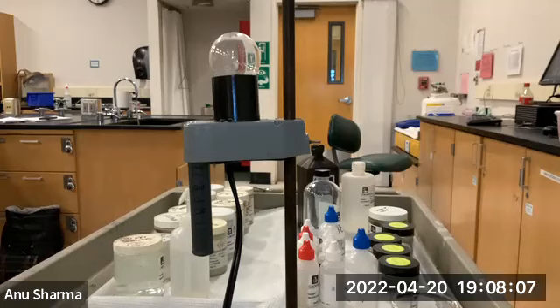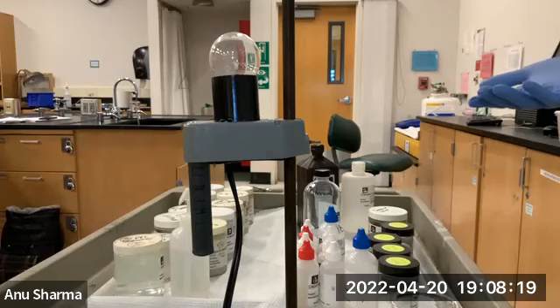I personally do not know what to put in this, because many of them either ionize or they don't ionize, or they weakly ionize. So pretty much we can just leave that column. We can write none in that, all of them. So anyways, let's look at first of all the deionized water.